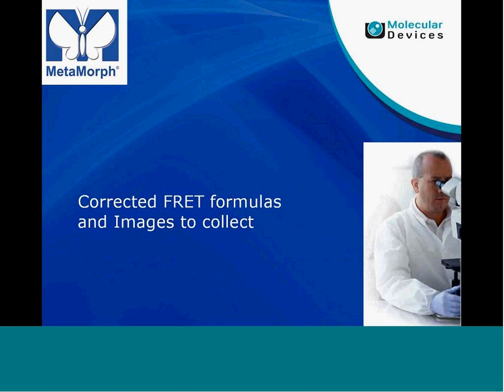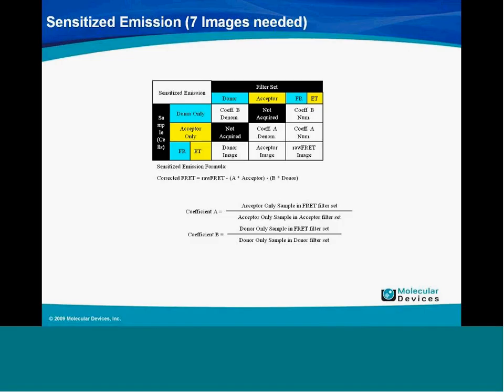So looking at the corrective FRET formulas and what images you need to collect within MetaMorph to do the analysis. One of the things we're not going to get into is a discussion of which is the best method to do FRET. We provide the tools that enable you to do it. It's going to be up to you to decide which method you want to use, based on the research that you've done through the publications.